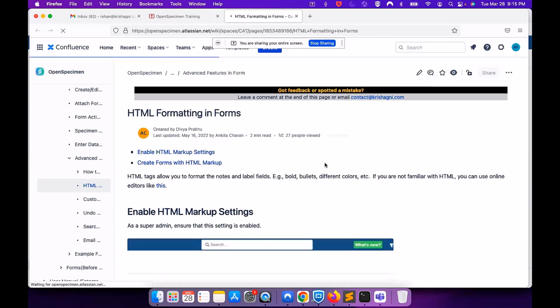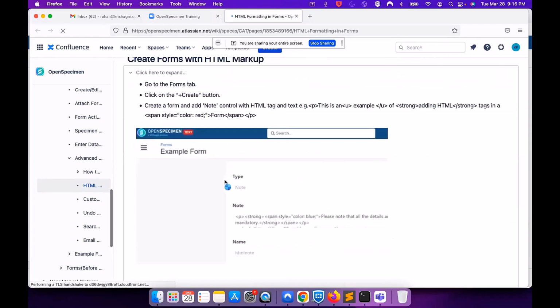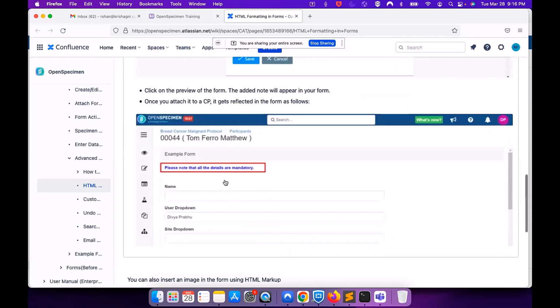Yeah, yeah. And that kind of stuff. But the thing is, better for UI, that is not a wise thing to do.